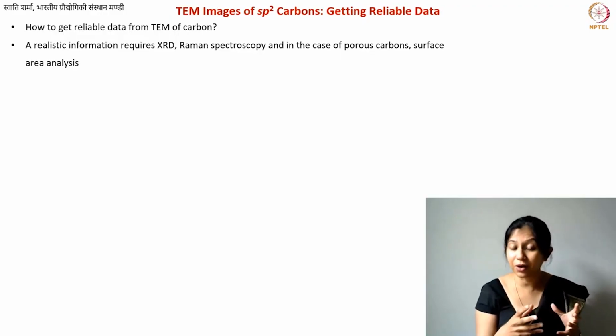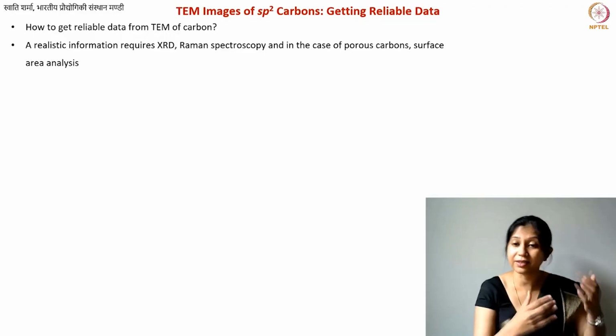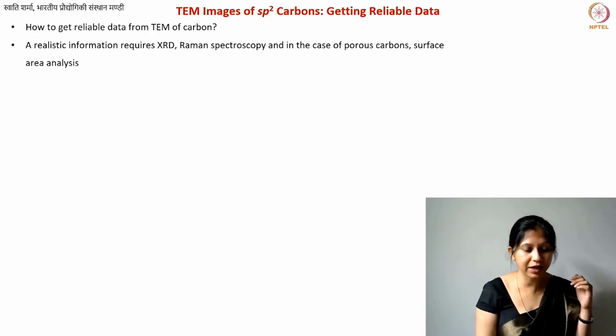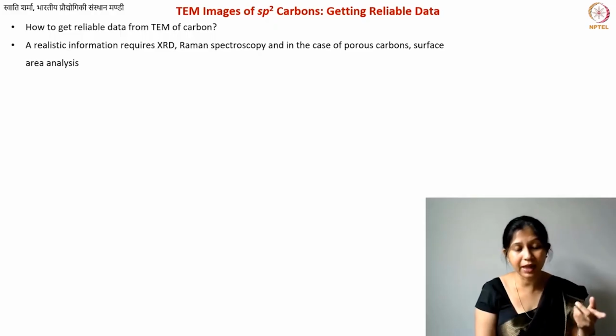So this gives you information that can also be deduced from the density of the material. Because for example, these non-graphitizing carbons are very low density materials. So in principle, they should have some porosity, but at the same time, they are impermeable to gases and liquids, which means you have pores but closed pores. And closed pores are not really visible, so you can also not evaluate them using other porosity measurement techniques. So it's really difficult to understand them. TEM in that case has been really helpful. That is how we understood that.